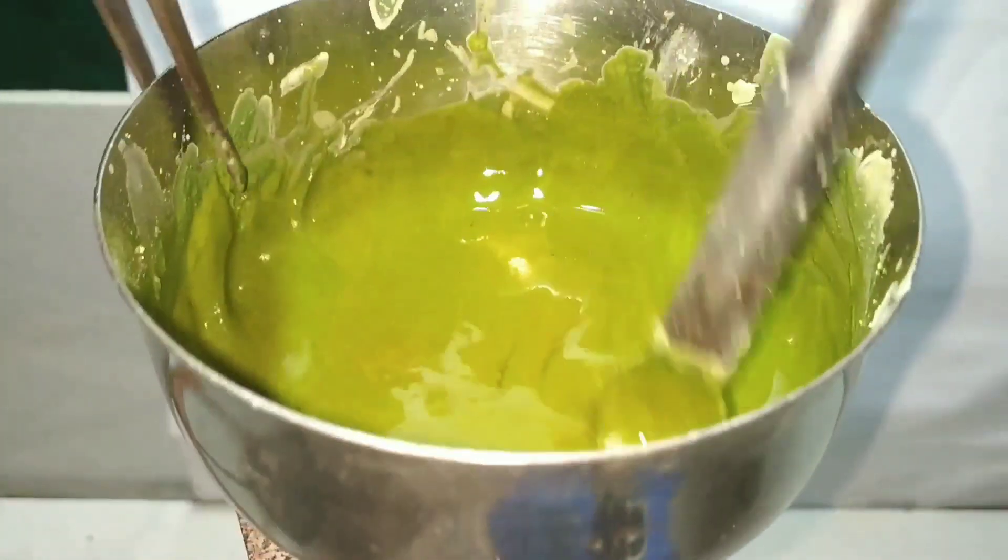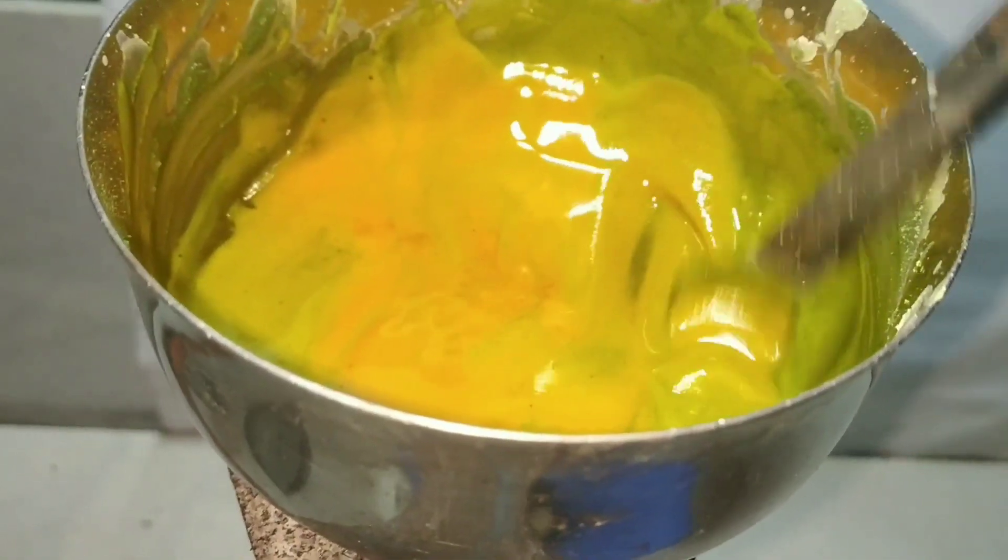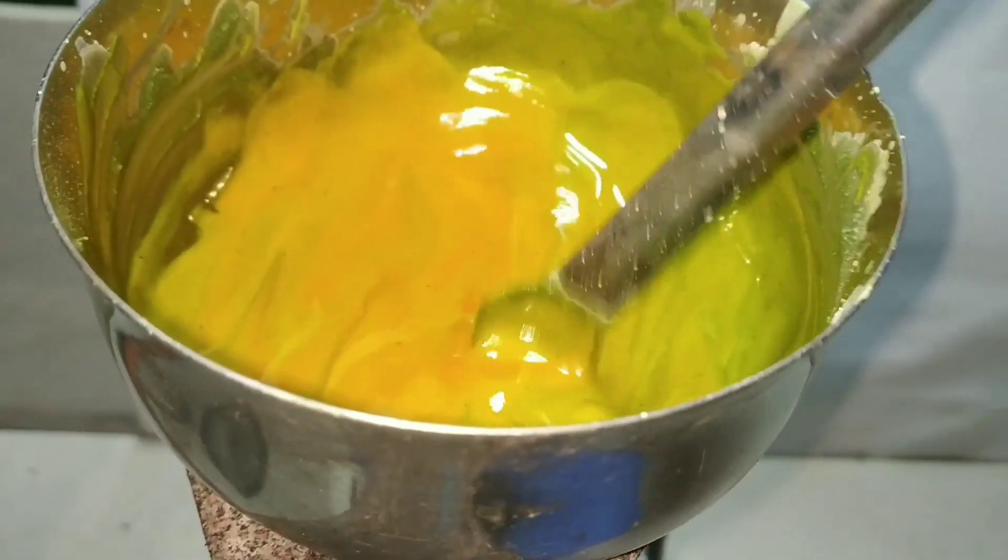By 20 minutes, the reaction mixture has become a yellow paste, and now we put off the flame and let it cool.